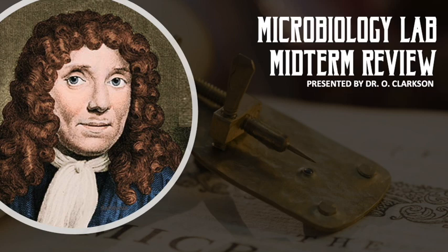What about the other stains? We used positive stains, and then we also used what? Negative stain, right? Negative stain, negatively charged. It gets repelled from the inside of the cell, so you can see the background really nicely. What does that allow you to do? What kind of organisms is it good for? You're not just seeing the shape of the cell, but also some other components of the cell. So capsules? Yeah, encapsulated organisms you'll be able to see with a negative stain. You can also see biofilms, but capsules are what we were stressing in lecture.